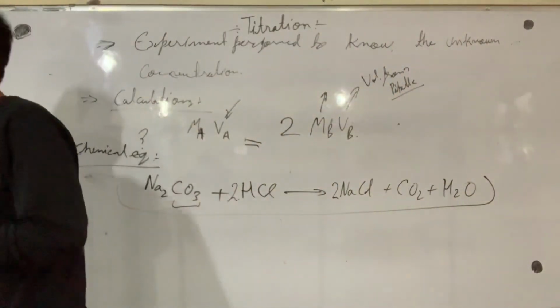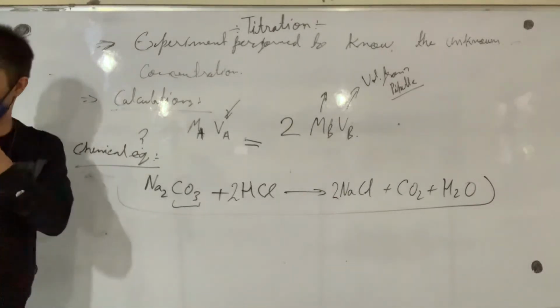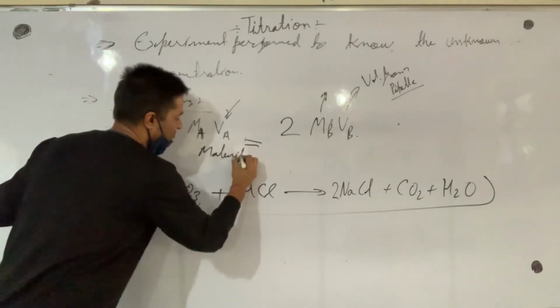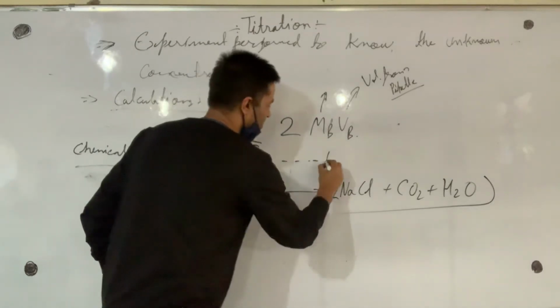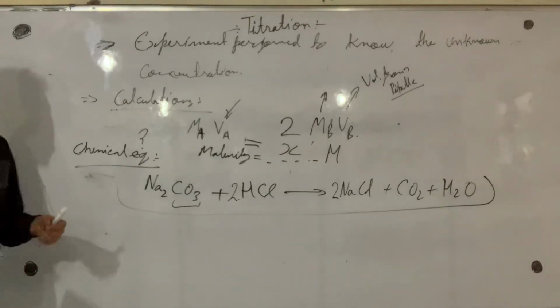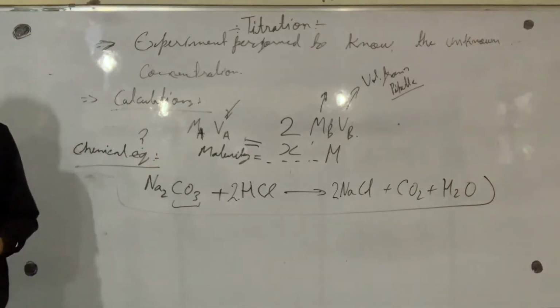Next is calculation of strength. So molarity is calculated. So how will you get the answer? Molarity is equal to x molar. Suppose you will have x molar.